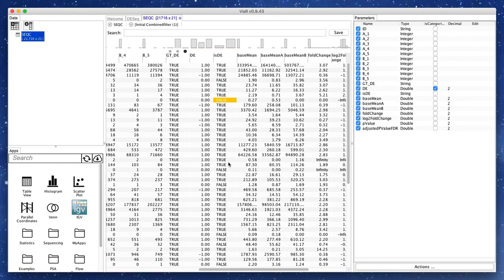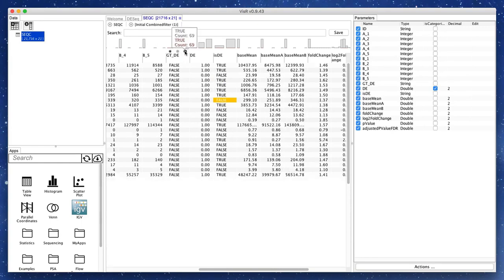This brings us to the question of how the detected DE state of other genes should be interpreted. In other words, we want to know whether the statistical test that DE-seq performed based on our input parameters was a sensitive test or a specific test.